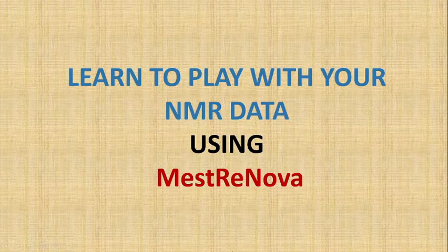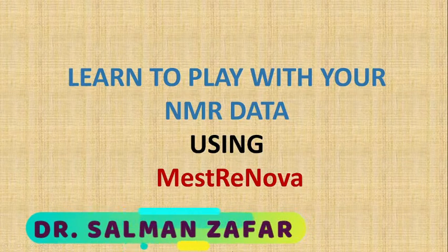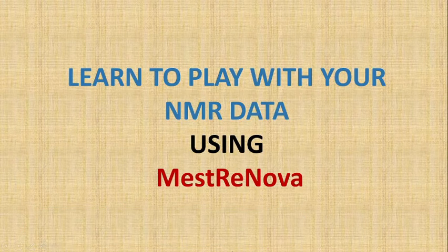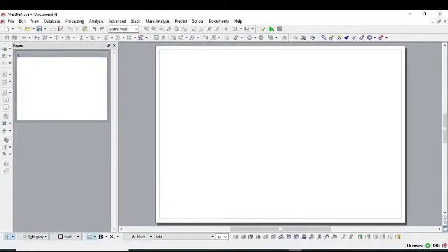Hello, dear students. In this session, you will learn how to play with your NMR data using the software MestReNova. So I'll tell you a few details about how to use the software and how to manage your spectral data to get maximum information from it. So let's begin. And let's start our MestReNova.